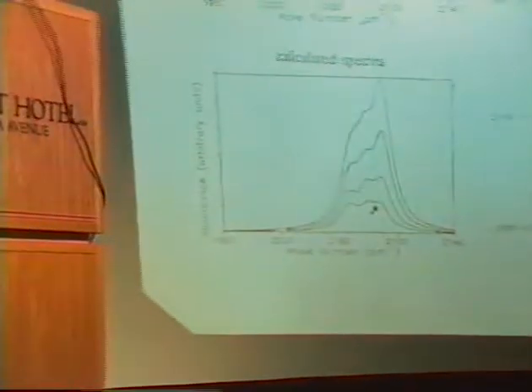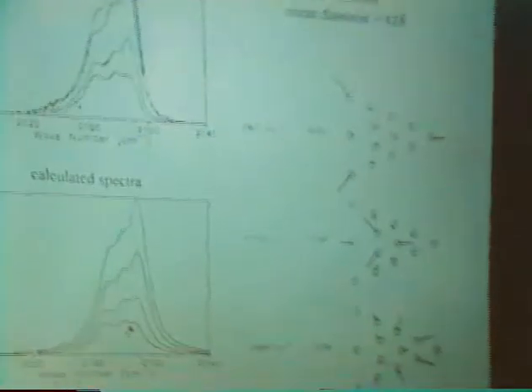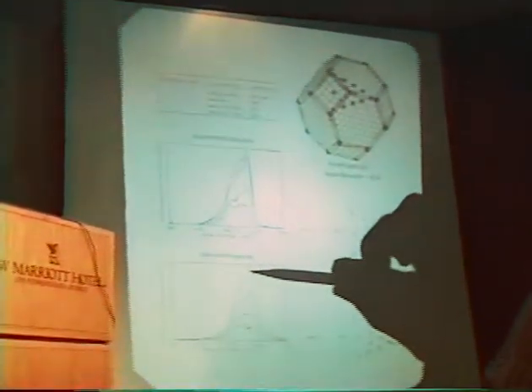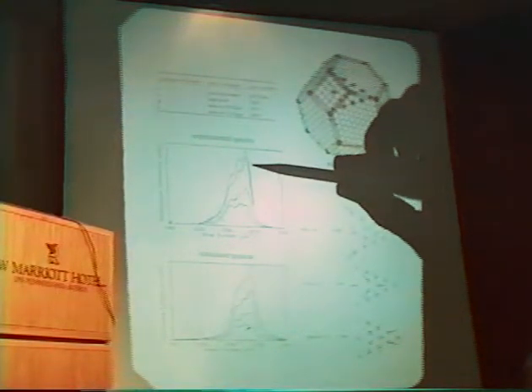So all of these couple together and give a frequency at about 2090. Now, we've continued to expand, and you see we get these model spectra, which look almost embarrassingly similar to the experimental spectra.